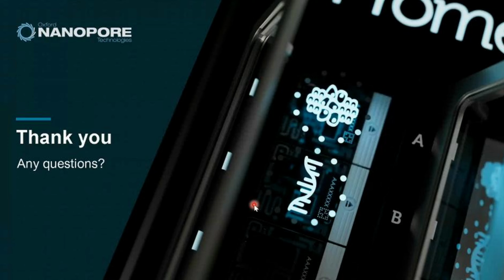This toolset does not need any culturing or enrichment, because we use PCR to amplify the bacteria using universal barcoding primers, the 16S 27F and 1492. Therefore, we are skipping the culturing step. That is the good thing, but the downside is you only get the information about the identity, but nothing else.